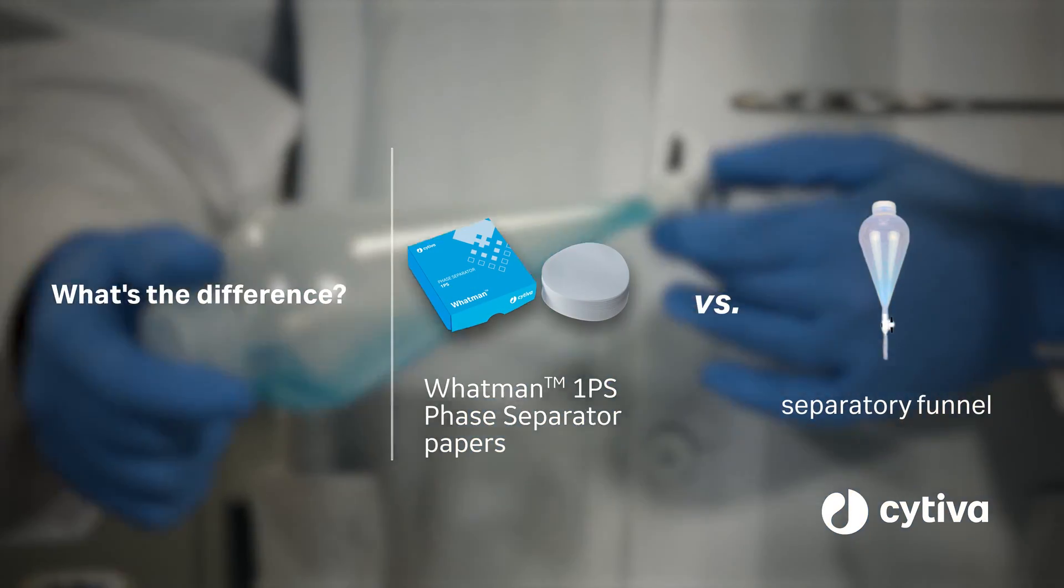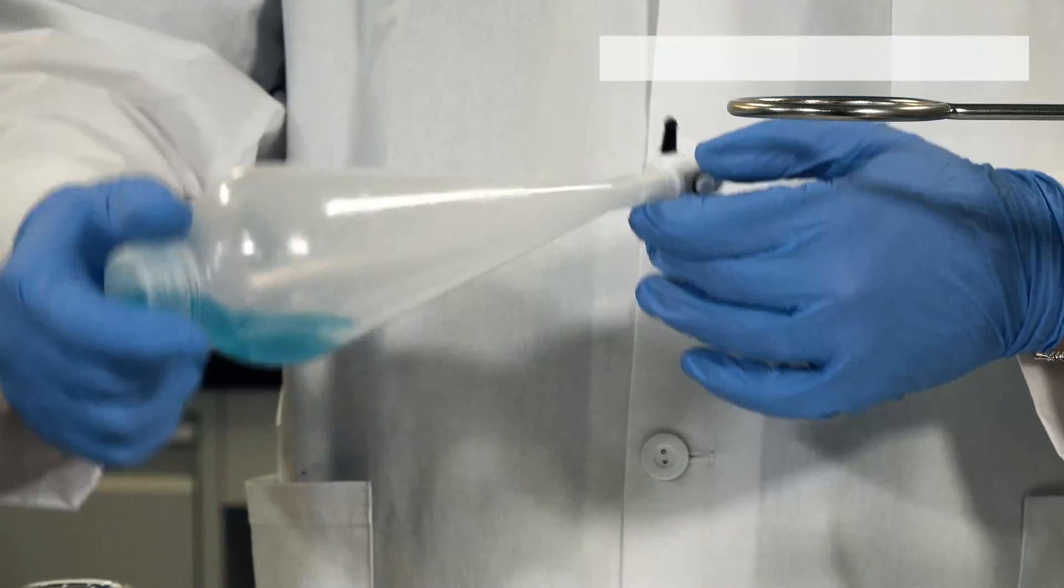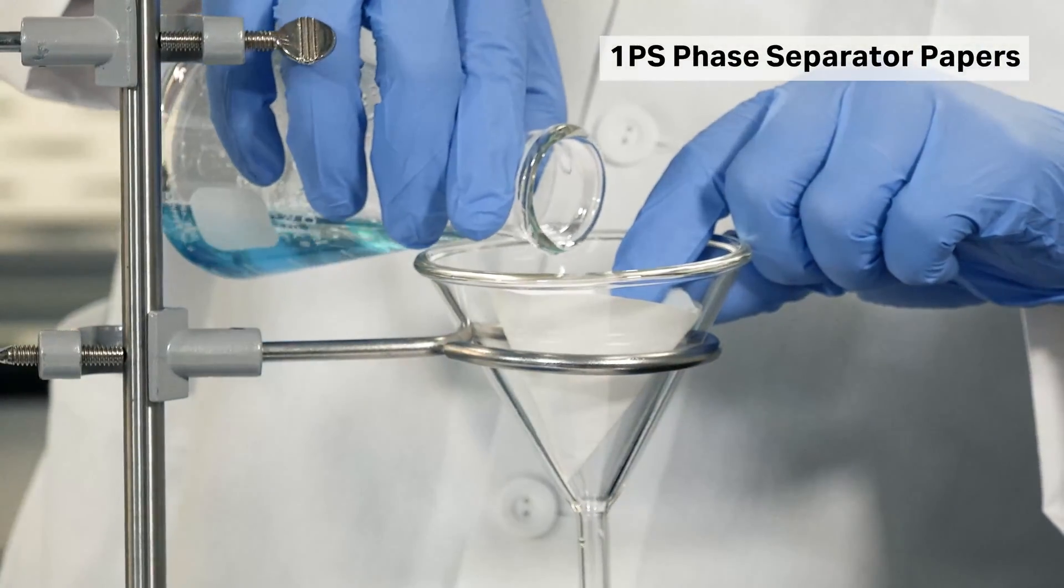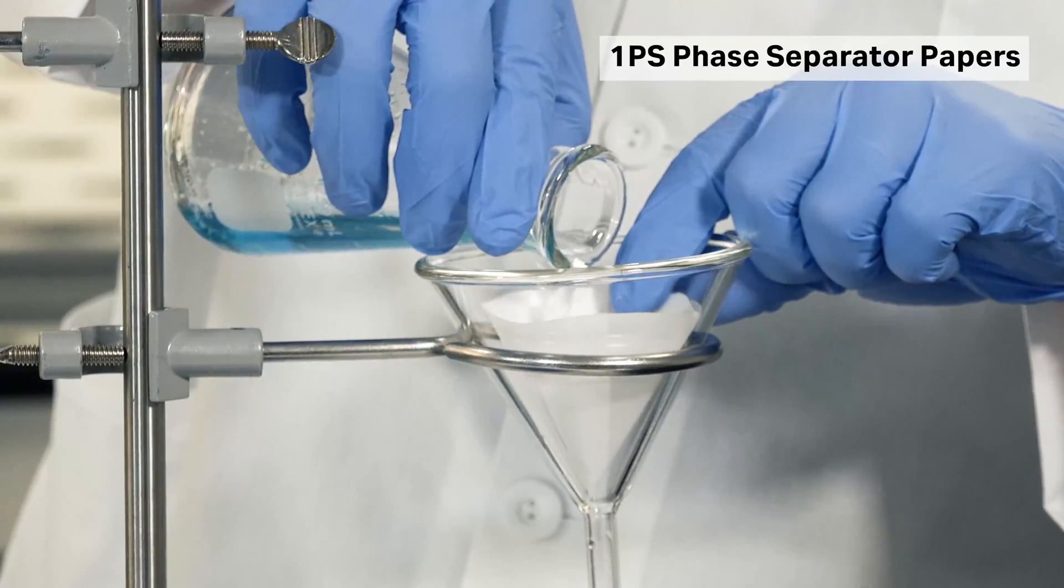Today we will be showing the difference between a standard separatory funnel and the Whatman 1PS phase separator papers from Cytiva for a liquid-liquid extraction.